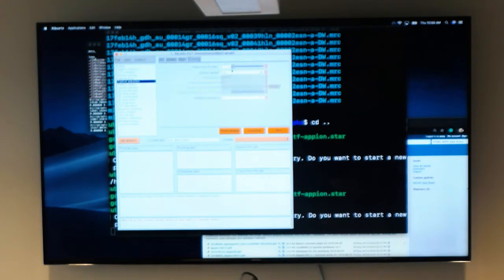And for the running tab, certain processes are CPU based, certain processes are GPU based. For example, this is a CPU process, and so remember you have 32 CPUs, so you can run it with 32. Maybe you can run it with 33 because one is the master and the rest are slaves.